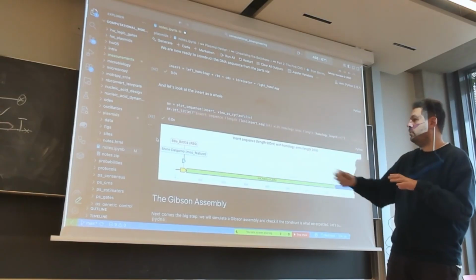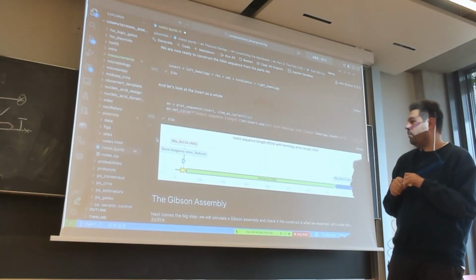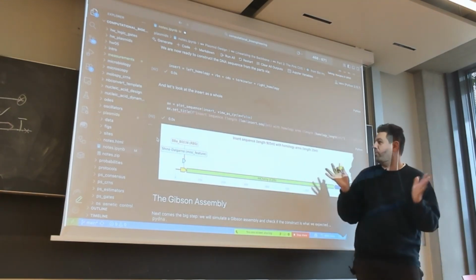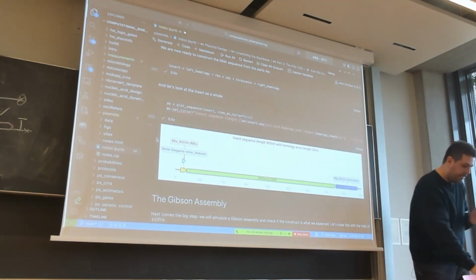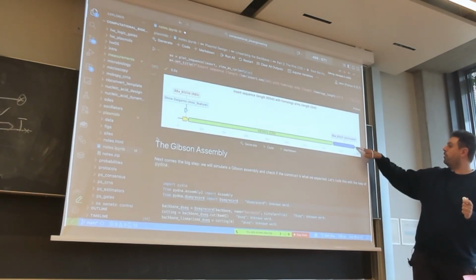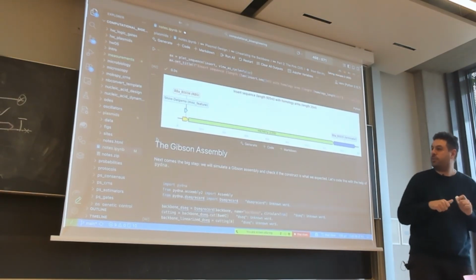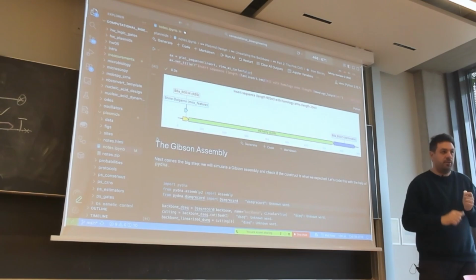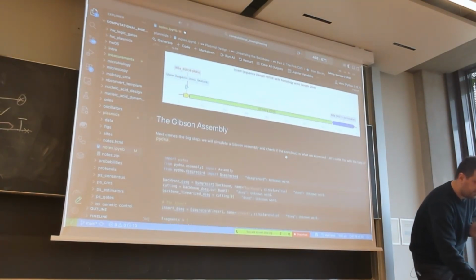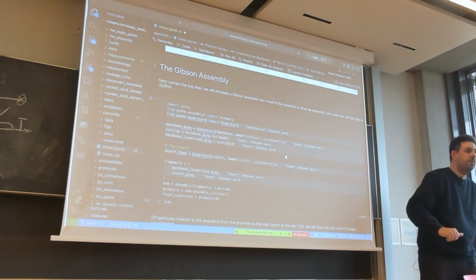And here we just look at it. Looks exactly as expected. Everything is fine here. And you can even see the homology arms, the little things here on the side. Okay, now the time, still good.